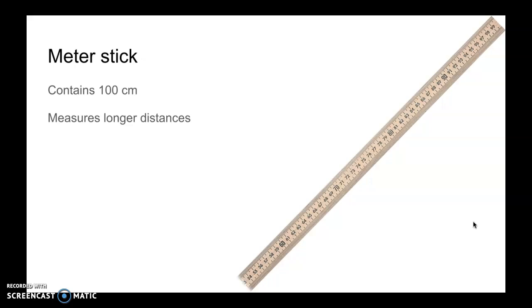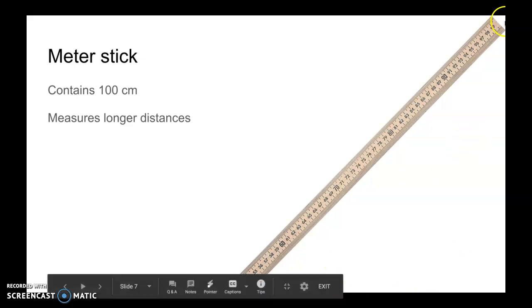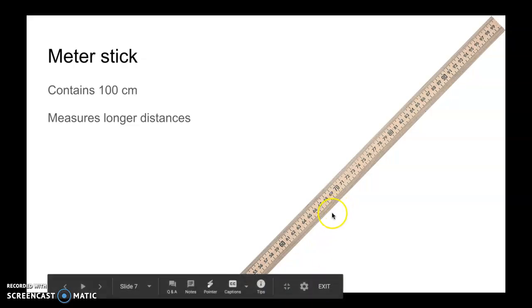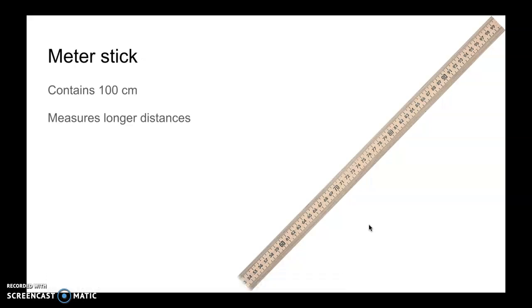This is a meter stick and we know it's a meter stick because it's exactly a hundred centimeters. These whole numbers are a centimeter. A centimeter is about the width of your pinky. This would be used to measure distances like length, width, and height that are bigger than a ruler. The tiny dashes are millimeters so you can actually measure to the nearest millimeter which is a tenth of a centimeter. We do not use inches and feet and yards in science.